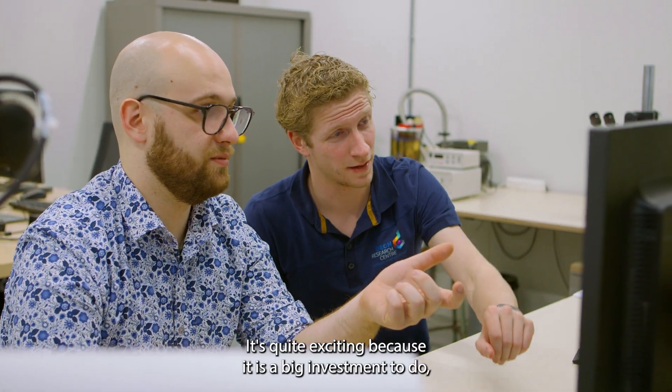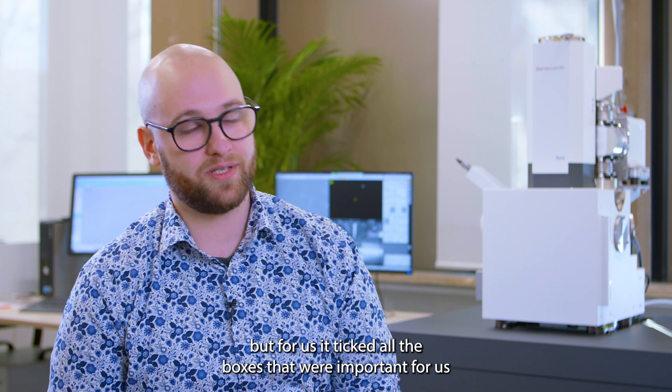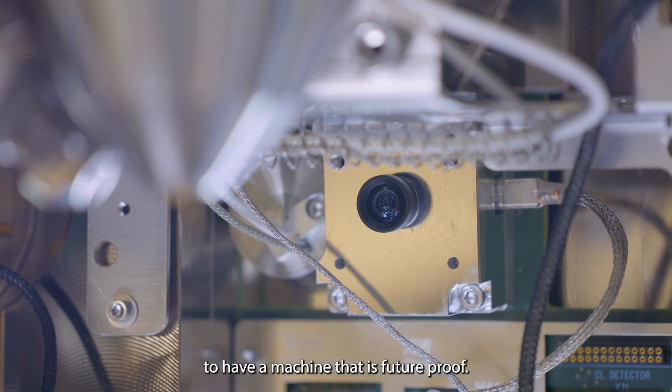It's quite exciting because it is a big investment to make, but for us it ticked all the boxes that were important for us to have a machine that is future-proof.